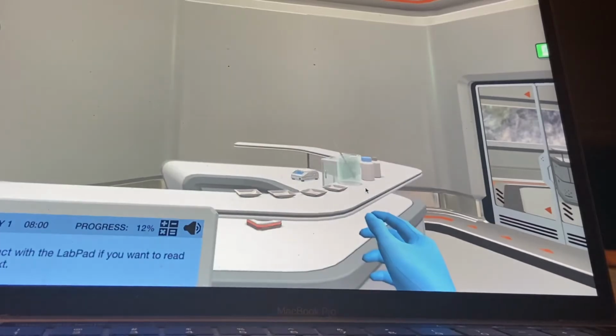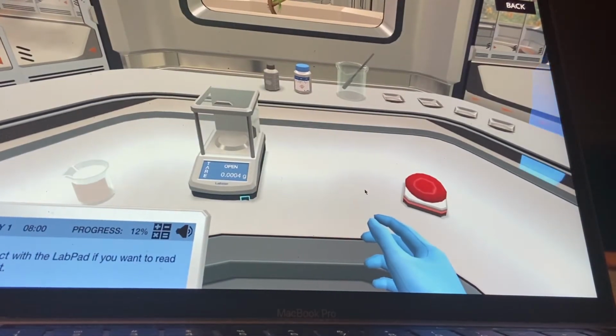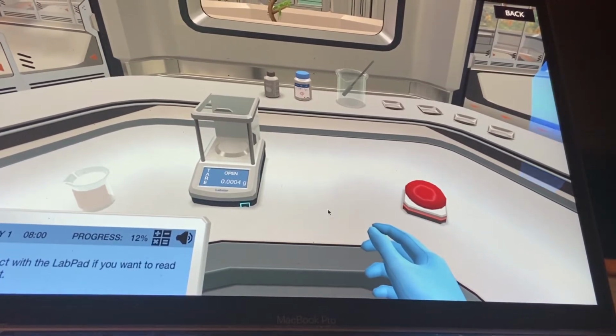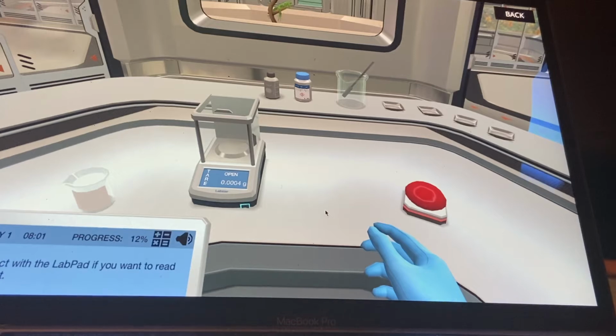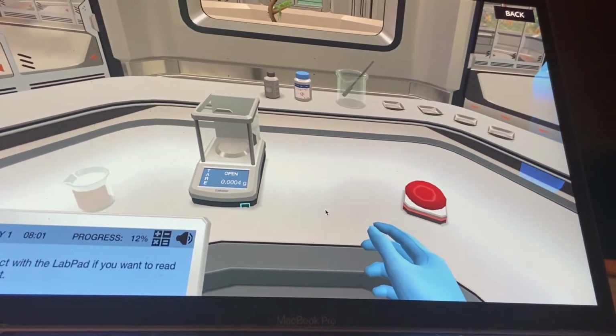Your mission today will more specifically be to prepare a 500 milliliter aqueous solution of ammonium chloride at 0.300 molar. Ammonium chloride is a salt with a very high solubility in water. You have probably eaten it at some point, as it is actually used to flavor some kinds of licorice. That doesn't mean it's safe for you to eat the pure compound or drink the solution though.